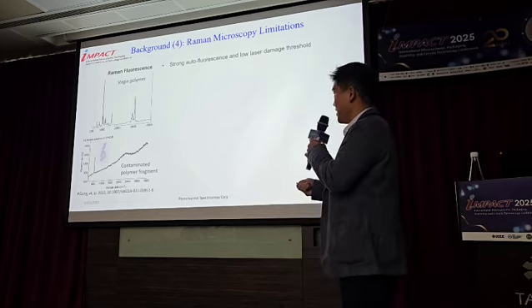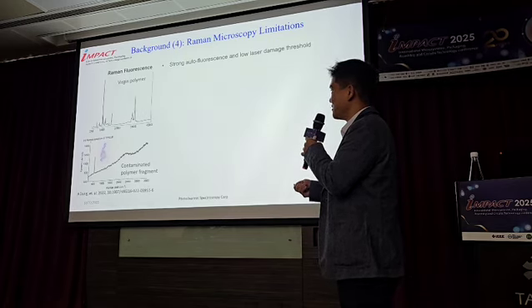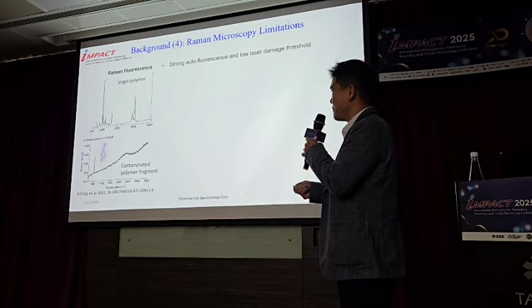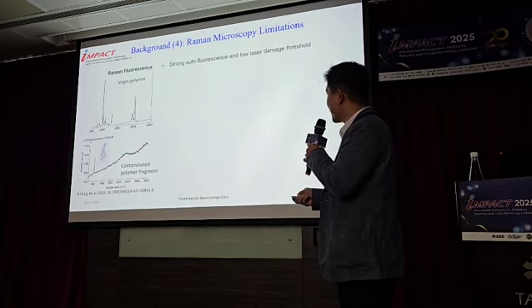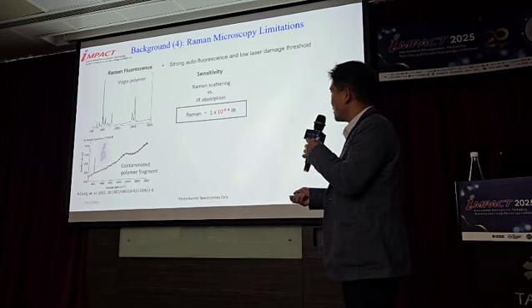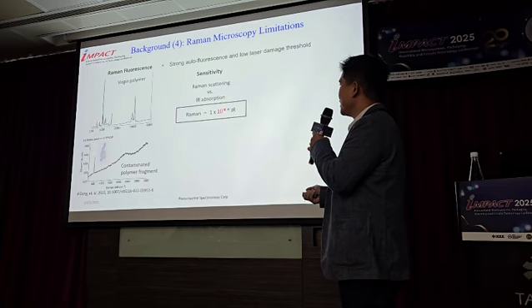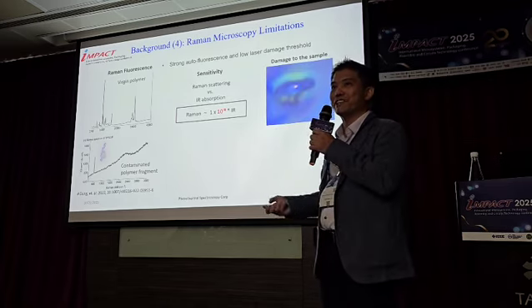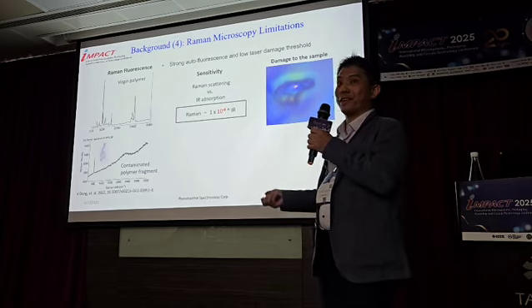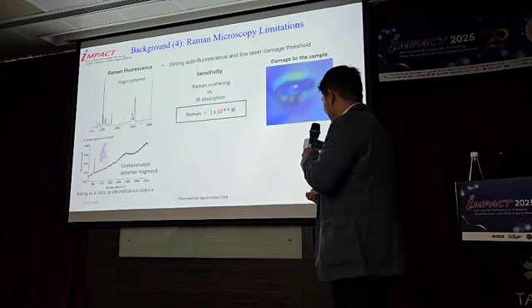It is quite easy to get a Raman spectrum when we have the material pure. But as soon as it is contaminated with, or has, a color master batch of some sort, the fluorescent baseline is going to be quite strong. Naturally, Raman is 8 orders less sensitive than IR, so we often face a situation where, when we try to get more signal, we burn the sample. Oftentimes that's what I see. Our customer gives a sample to me, and I only see these holes on the surface.